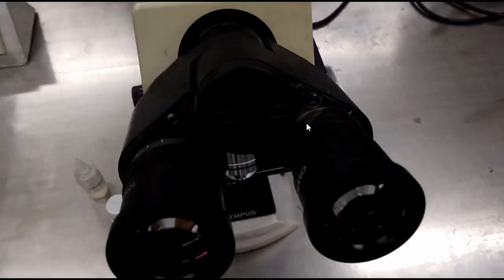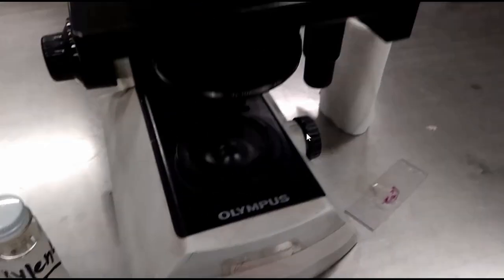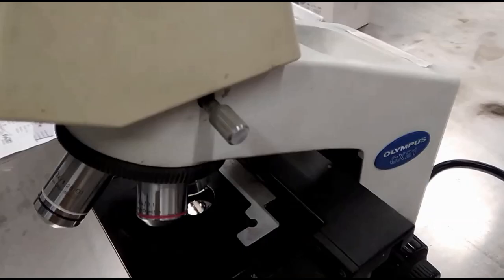Leave the objective lens at the 10x objective position. Switch off first from the microscope and then from the main switch. Finally, cover the microscope.